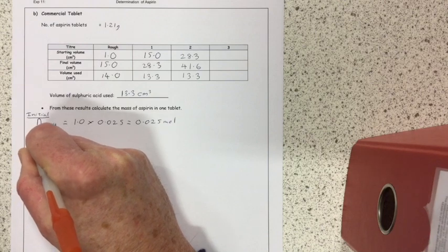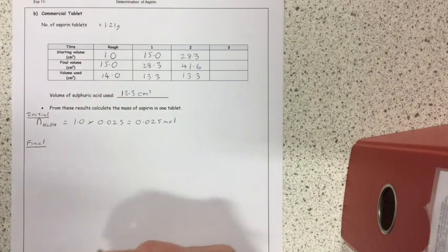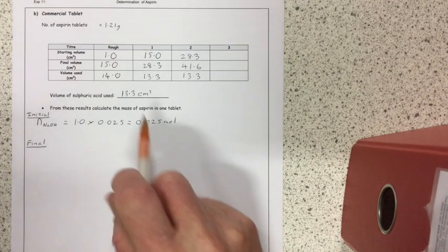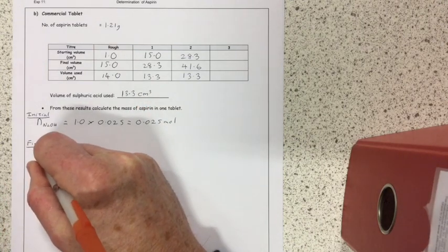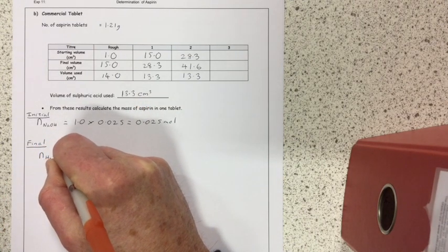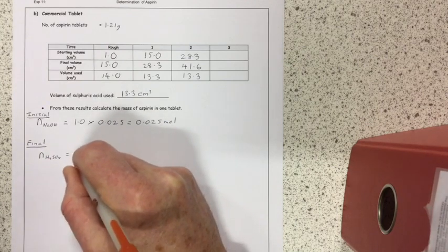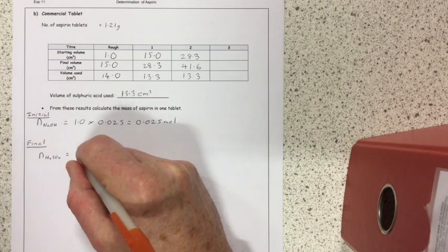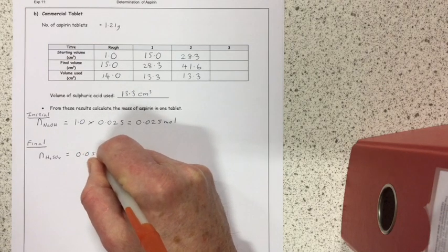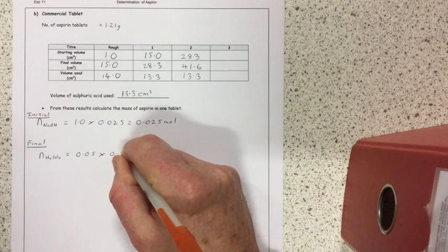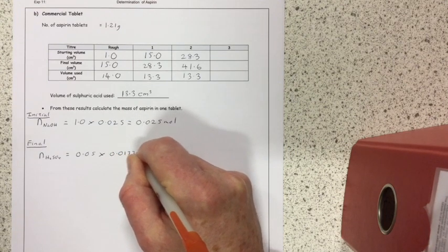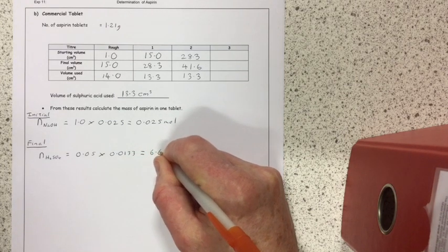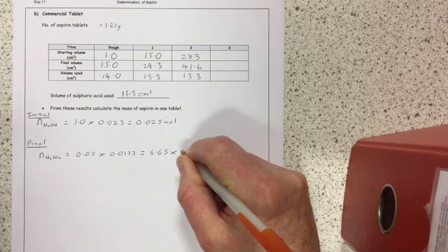Then, we have to work out how many moles of sodium hydroxide were left over at the end. So, to do that, we used the results from our titration. So, the number of moles of sulfuric acid in the titration, where the concentration of the sulfuric acid was 0.05 moles per liter. We used 13.3, so the volume is 0.0133. So, the number of moles of sulfuric acid was 6.65 times 10 to minus 4 moles.